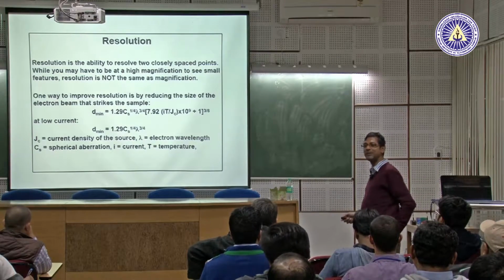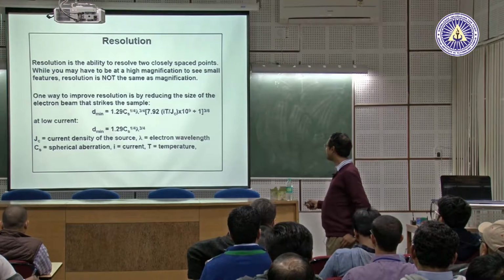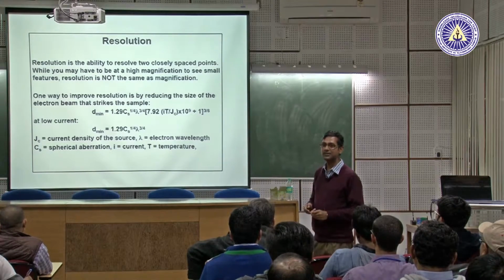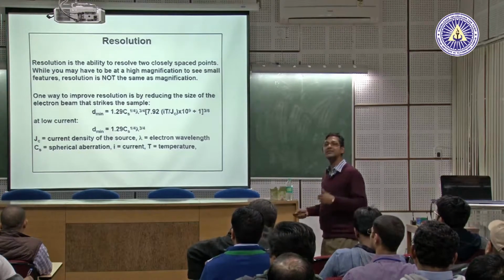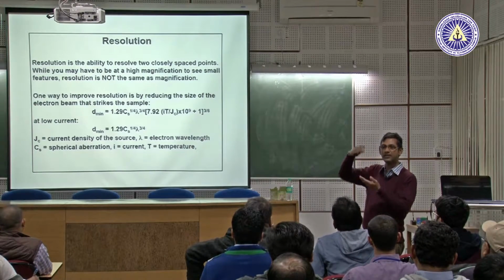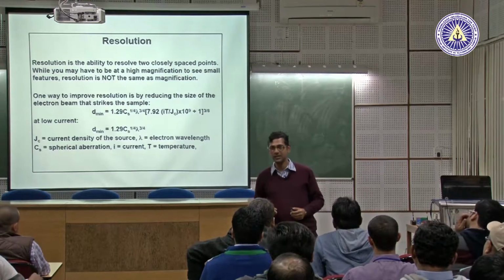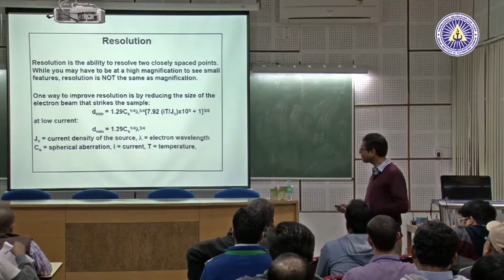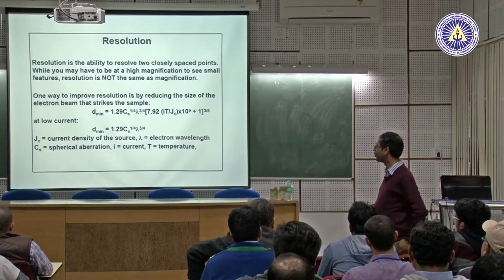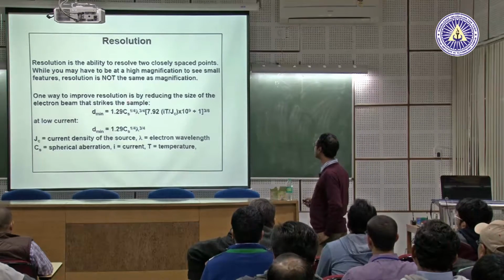And you cannot prepare a lens, although it has been done, but I will not talk about it, in which Cs is almost 0, correct? Because it is the manufacturing fault of the lens. In optical lens, you can have convergent divergent type lens. In the camera, it is there to reduce this spherical aberration, but you cannot make it 0. That is the idea. Electron lens, you can't even go that far. There are limits. There are other ways of doing that. Now technology has come in the last 10-15 years.